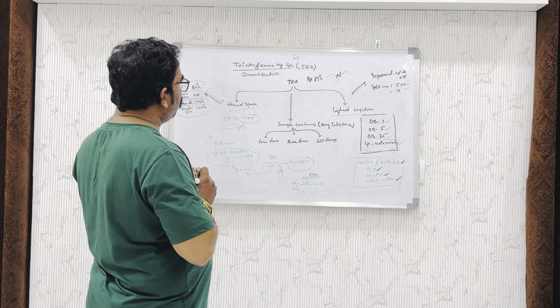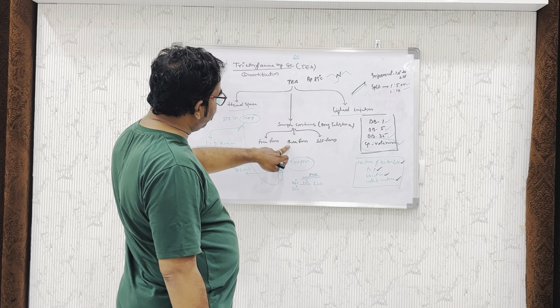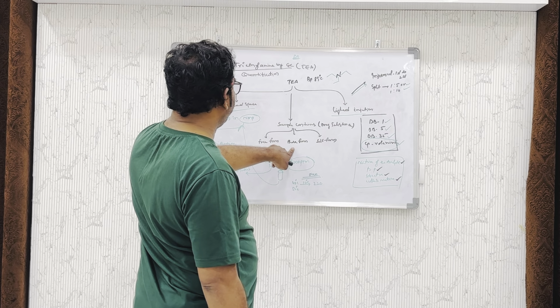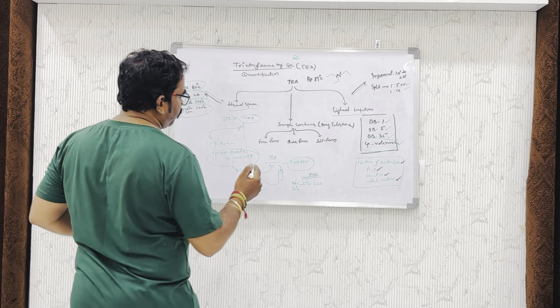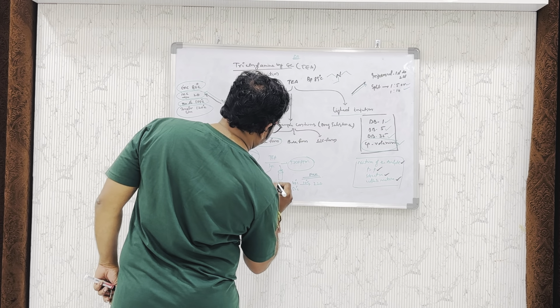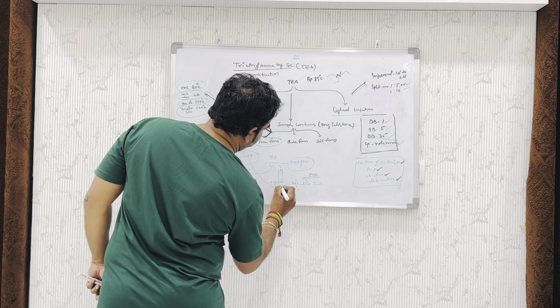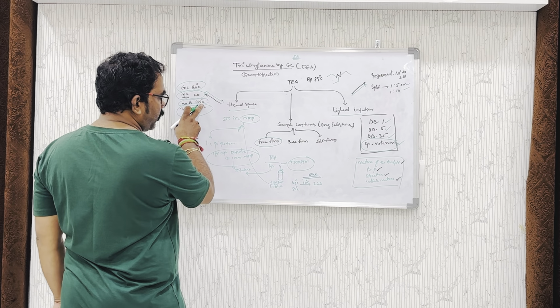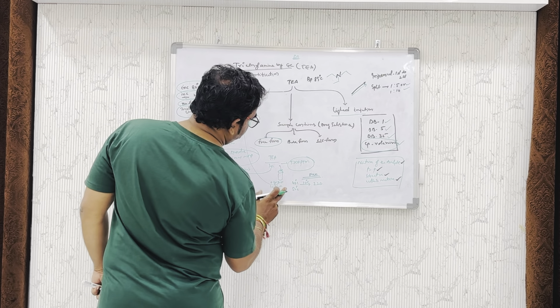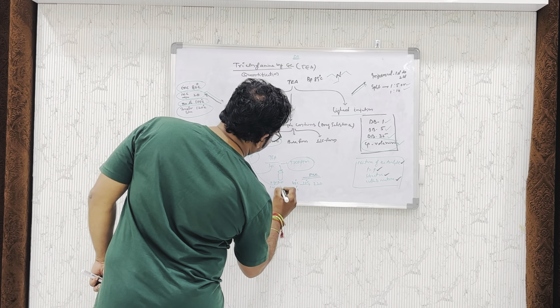If it comes to the sample, for example, the sample may contain free form, base form or salt form. This type of nature is available in the market. For example, if your sample is free form, then simply you can take 0.1 gram sample in a headspace vial, add 1 ml of diluent, then analyze through headspace. To check whether this method is working or not, instead of 1 ml diluent, you can add 1 ml of standard solution.